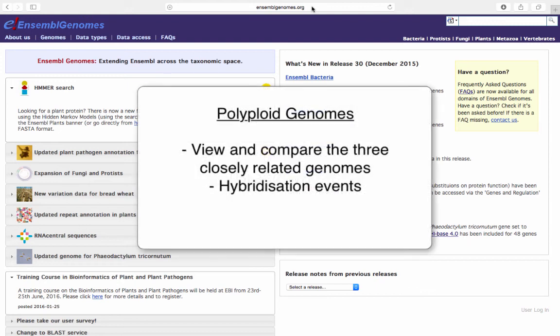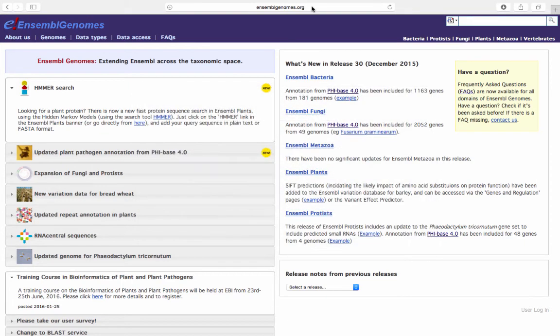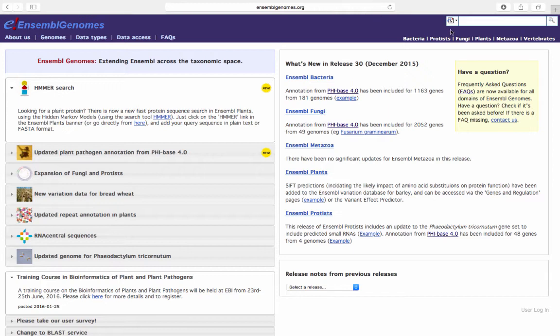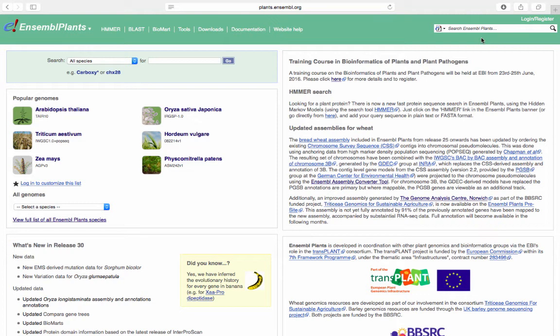The polyploid view option in the location tab of Triticum aestivum allows users to simultaneously view and compare the three closely related and independently maintained genomes that are the result of a series of naturally occurring hybridization events. From the Ensembl genomes homepages, navigate to the Ensembl plants homepage. Select the bread wheat Triticum aestivum from the Popular Genomes menu.